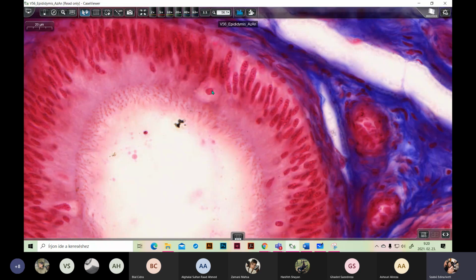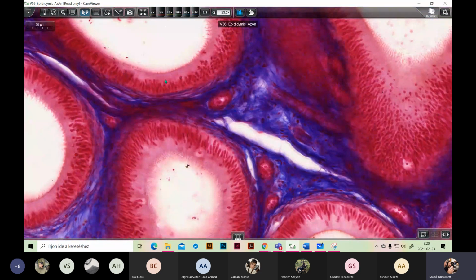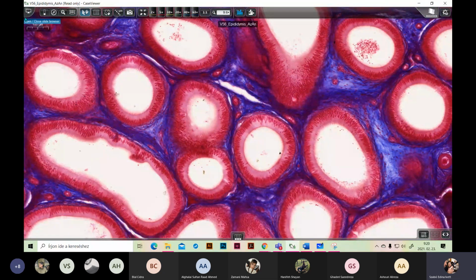Oh, lymphocyte, yes. It's a lymphocyte with roundish nuclei, and around the nuclei, more or less, we can see this paler zone. We can find lymphocytes in case of this type of epithelia as well. Okay. Questions about the pseudostratified columnar epithelia with stereocilia? Okay, and we have another slide.